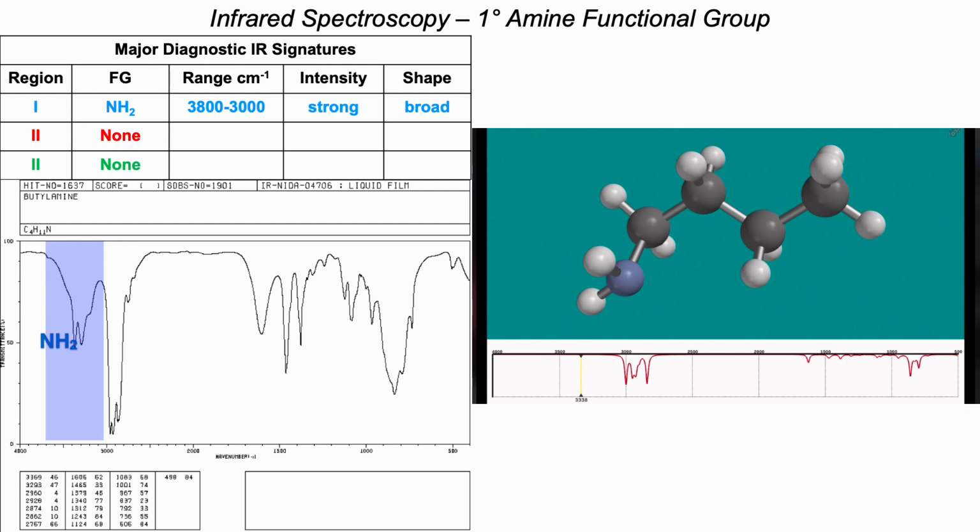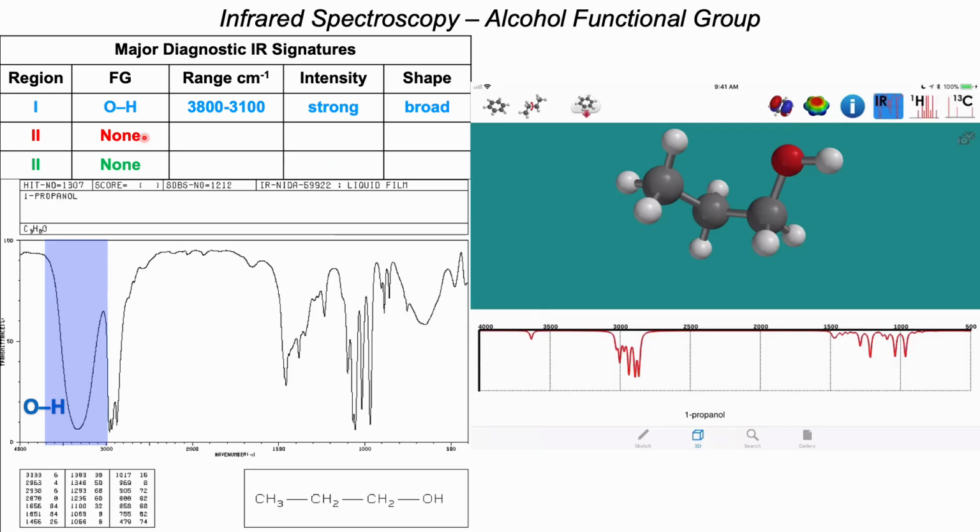So we'll go ahead and move on now to the alcohol functional group.